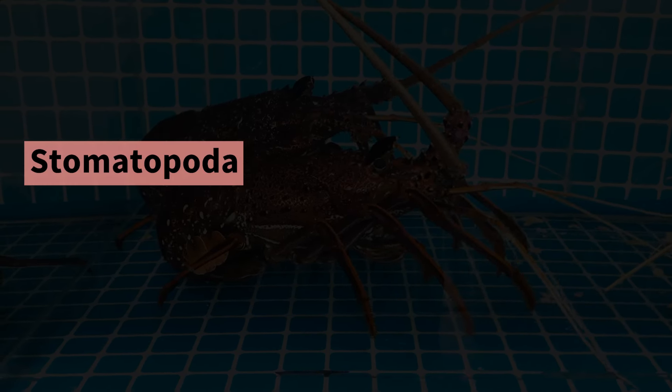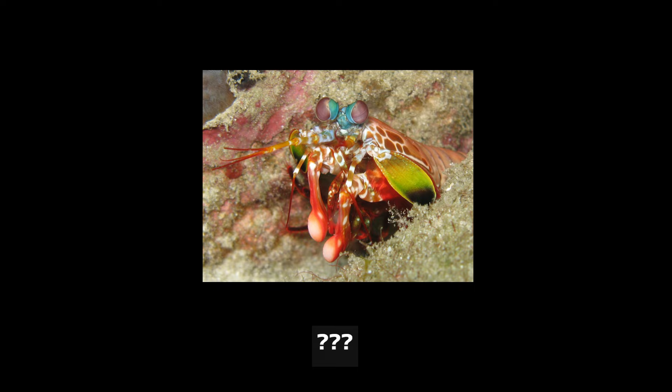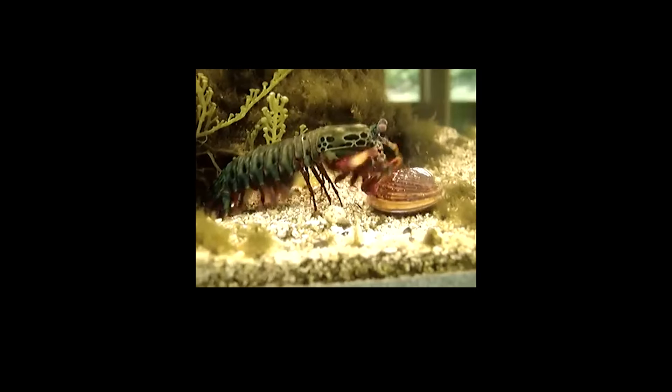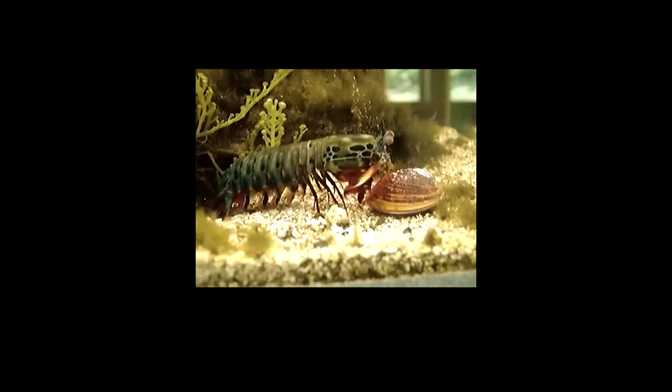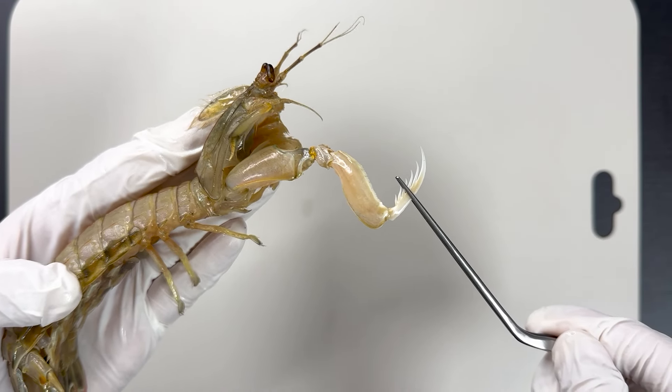Stomatopoda is the scientific term for mantis shrimp. They are known for their striking punch when hunting prey. The Japanese mantis shrimp is also a member of the stomatopoda order.